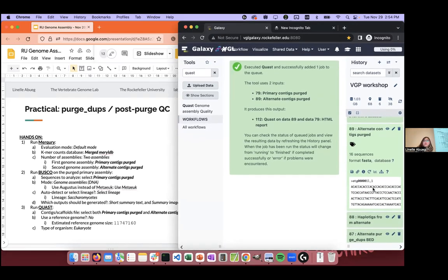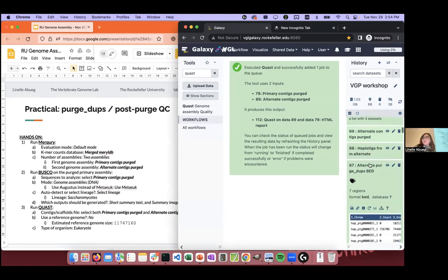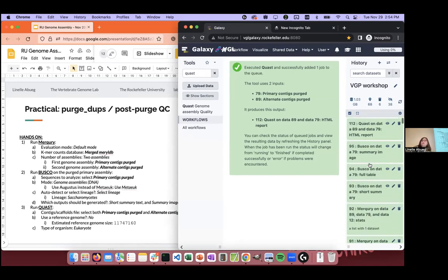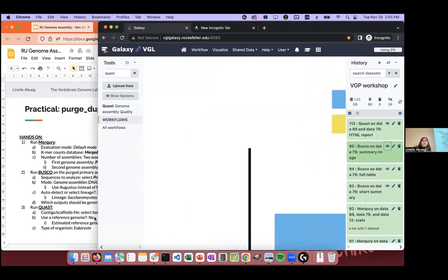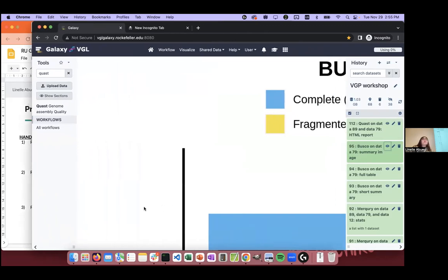Up some of those plots. I'm going to start looking at some of the stuff now. I think. Yeah, what's up?